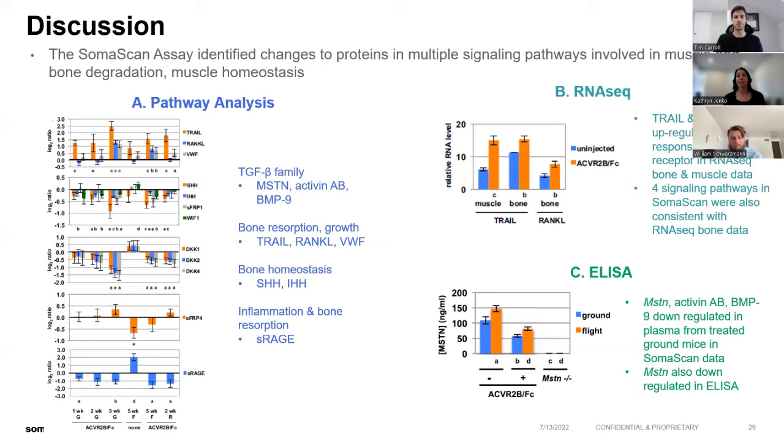This is consistent with the SomaScan data, where myostatin was also downregulated in plasma of treated mice. And so here you have this multi-omics and multiple platform approach that all support each other. Next slide.